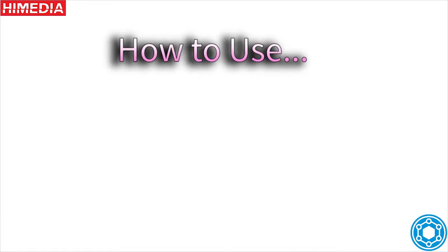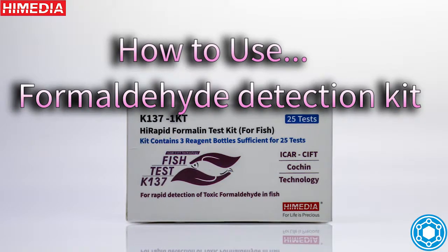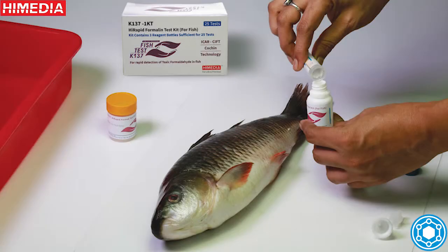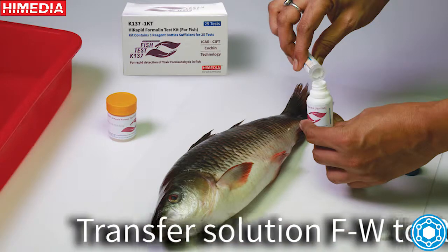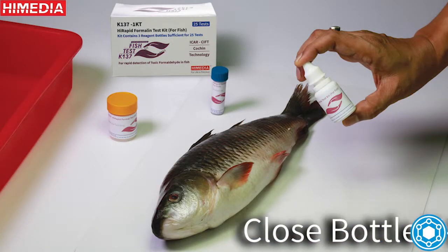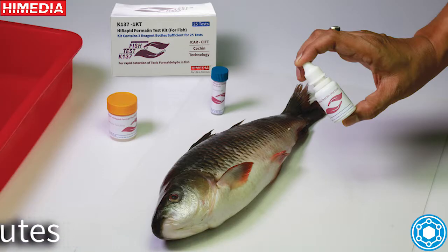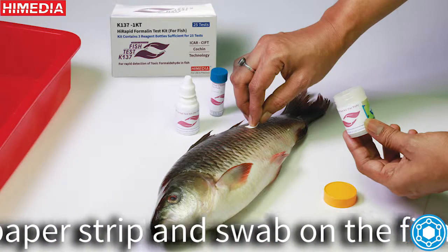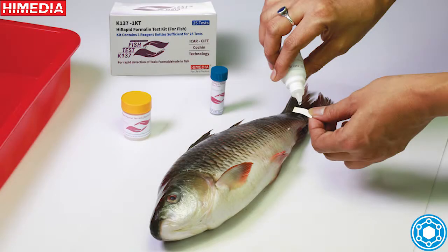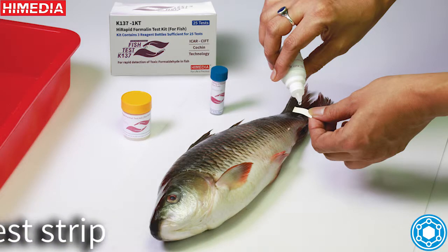How to Use the Formaldehyde Detection Kit: Transfer Solution FW to Reagent Bottle F2. Close Bottle F2 tightly and shake well for 2 minutes. Take a paper strip and swab on the fish 3-4 times in different areas. Add one drop from Reagent Bottle F2 to the test strip.